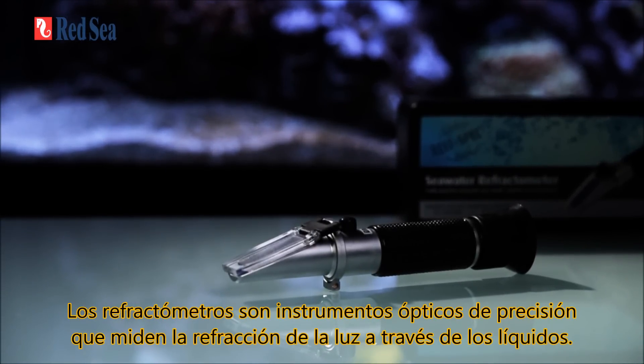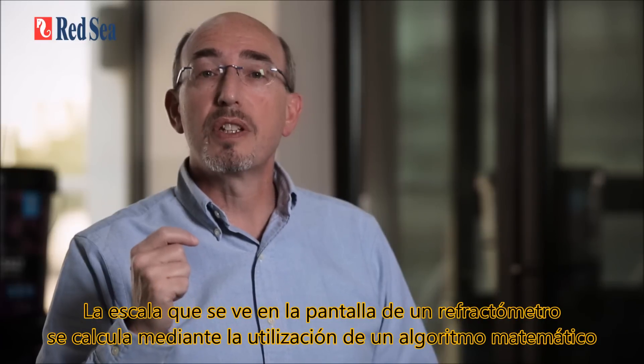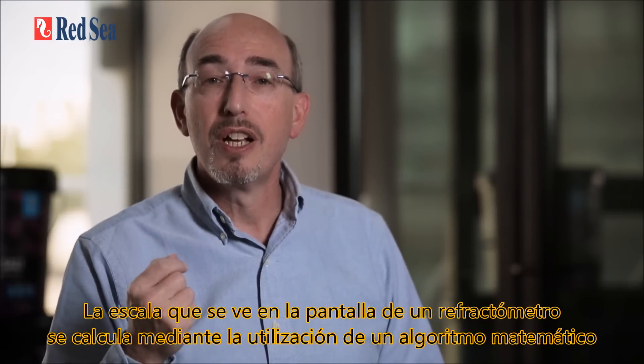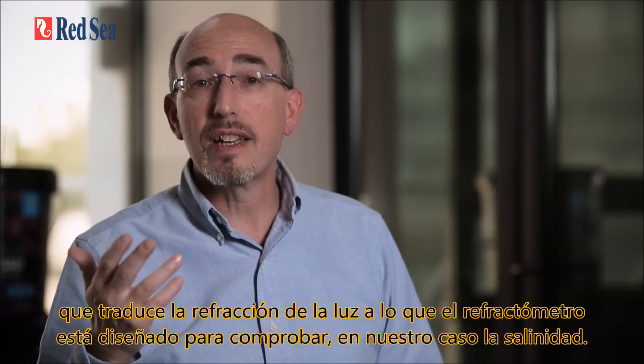Refractometers are precision optical instruments that measure the refraction of light through liquids. The scale seen on the screen of a refractometer is calculated using a mathematical algorithm that translates the refraction of the light through whatever the refractometer is designed to test — in our case, salinity.